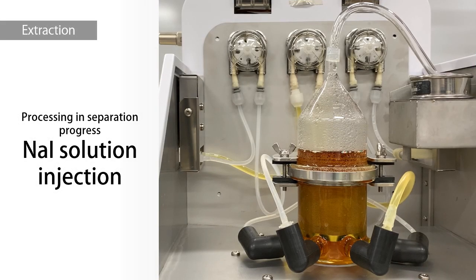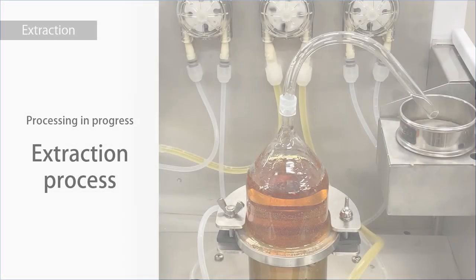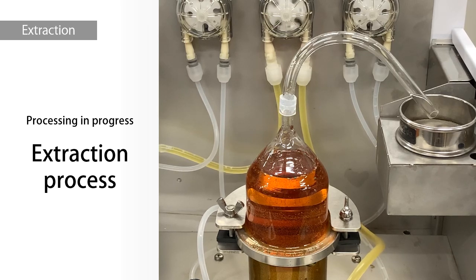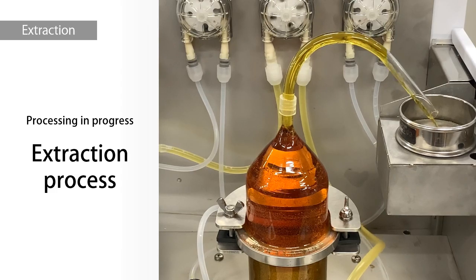Next is the separation process. Sodium iodide solution is injected from the bottom of the reaction vessel. The final step is the plastic extraction process. Plastics that are lighter than the specific gravity of the sodium iodide aqueous solution, about 1.6, are floating. Aqueous sodium iodide solution is injected from below, and the microplastics in the supernatant are collected on the sieve.